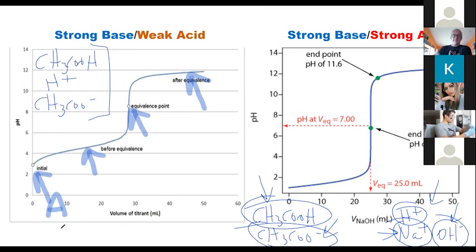Acetic acid. Yep, exactly. Because it's a weak acid. So like we said, with a weak acid, only about 1% of it, or less than 1% of it, ionizes. So the vast majority, like 99% of the acetic acid present, is going to be in that conformation with the proton attached. And then the H plus and acetate ion are going to be there in relatively the same low concentrations. So we would go 1, 2, 3, and 2 and 3 being basically the same. So that would be for A.